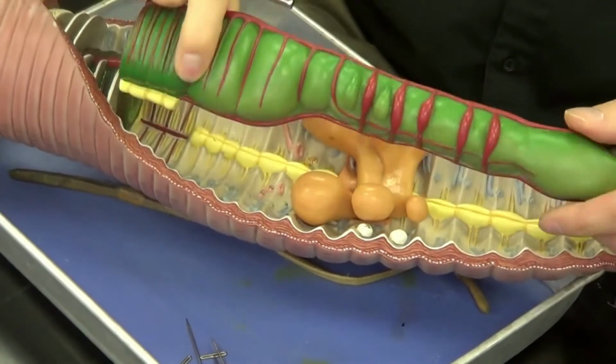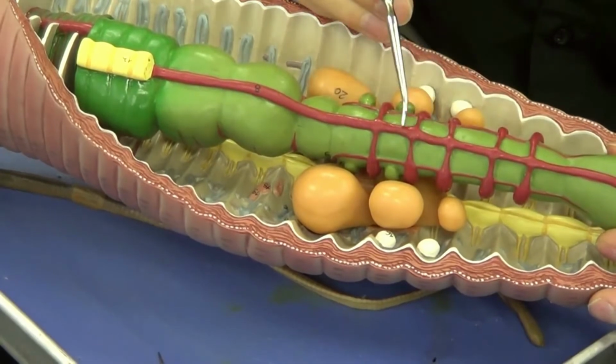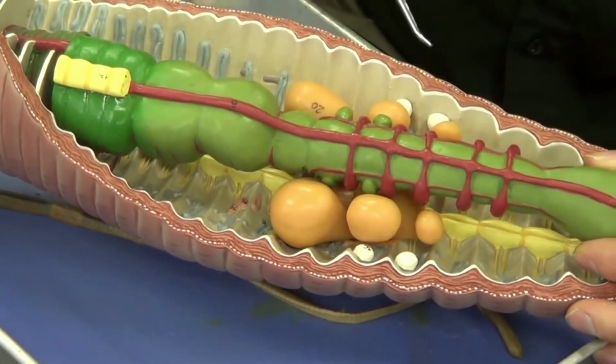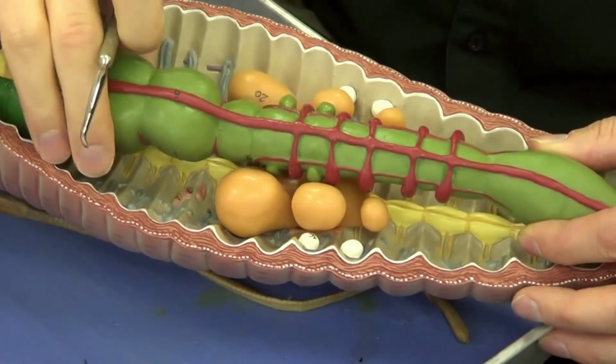If I turn this over, on the underside, the belly side of the earthworm, you'll see another blood vessel. And this is called the ventral blood vessel because it's on the ventral aspect. And this blood vessel actually returns blood back to the body of the earthworm.